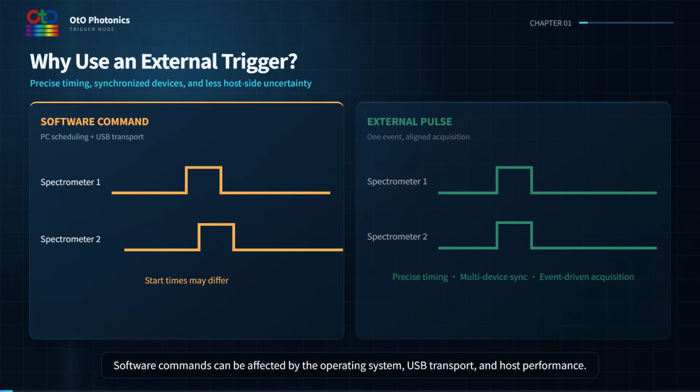Welcome to this OTO spectrometer tutorial. In this video, we will introduce trigger mode, also known as external trigger mode.